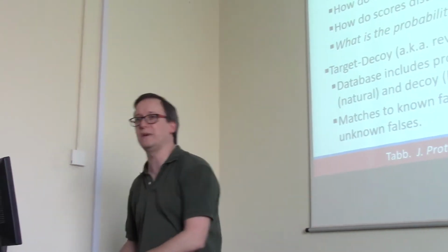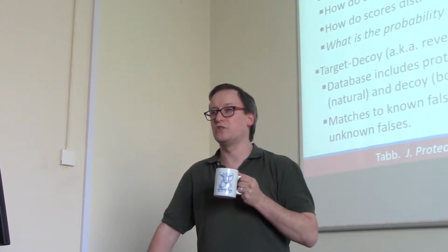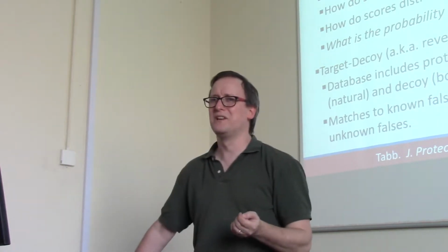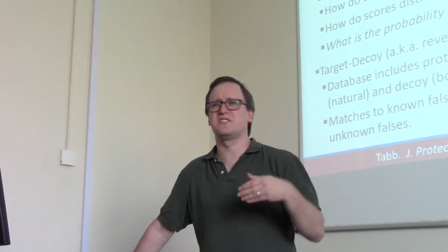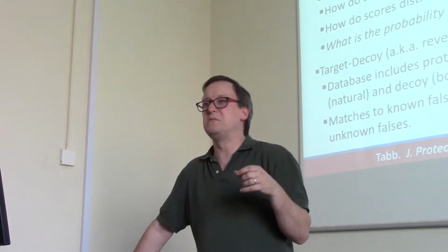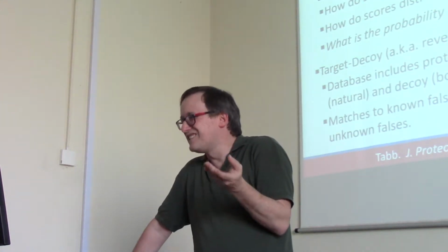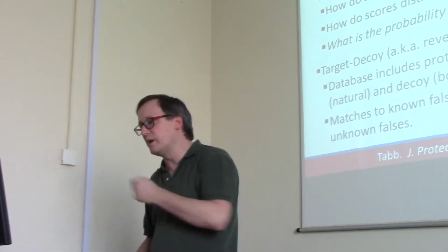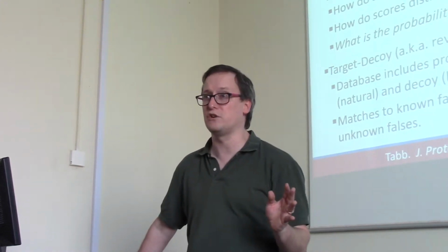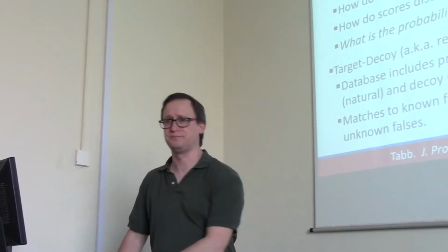Okay, that's grand. So we have a way now to put a putative sequence on each spectrum. But wait, some of them, the software did the best it could, and it gave some score to the best match, but the best match is still pretty bad, right? What if you only matched 3 ions for a sequence, but that was the best you did against this entire database? It's still not very believable. So we needed ways to control PSM error. PSM is a term that shows up a lot in the literature now, so it's a good term to know. So it stands for peptide-spectrum match.